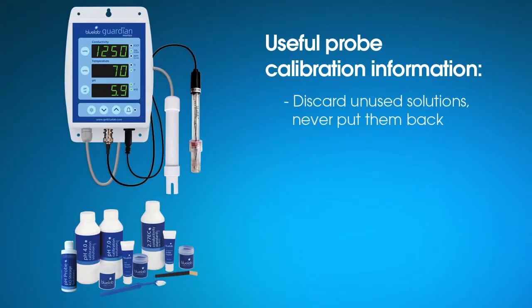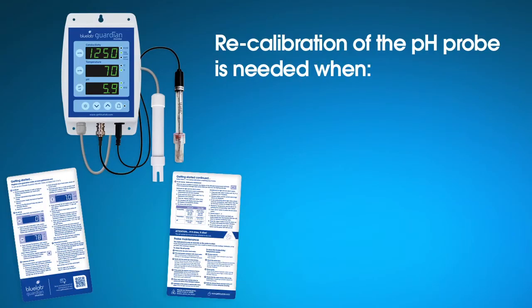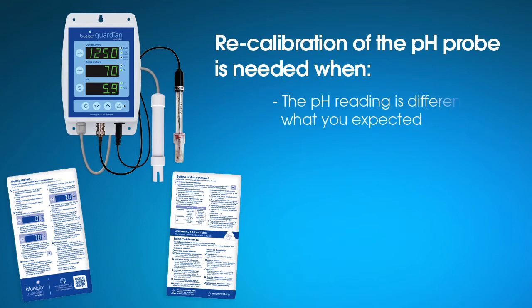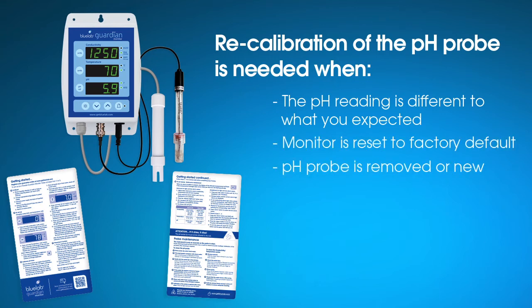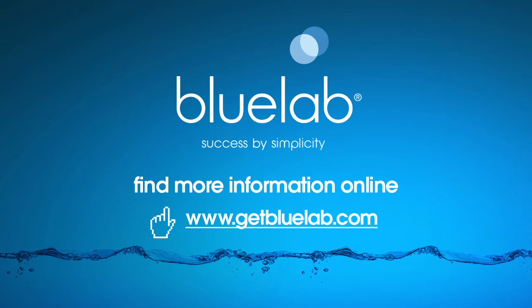Discard all used solutions. Never put them back into the bottle as you will contaminate the solution. Follow the full cleaning procedures for both probes each month to ensure accurate readings. Recalibration of the pH probe may be needed when the reading is different from what you were expecting, the Guardian monitor is reset to factory default, the pH probe is replaced with a new one or is disconnected from the monitor, the pH calibration indicators are flashing or have disappeared, or the pH probe has been cleaned. For more tips on using Bluelab products, visit www.getbluelab.com.